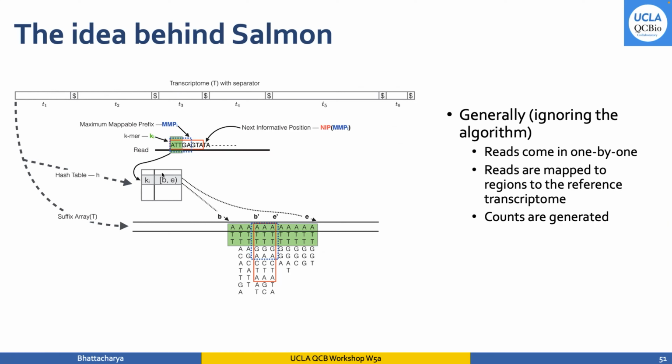A read comes in, and we get an idea of where the beginning and end of different patterns match, and we can group reads into relationships with one another that tell us which exons each group of reads maps to. That grouping gives us a probabilistic estimate of how many transcripts we have for each isoform of a gene, and then accordingly what the gene counts should be under different kinds of normalization parameters.